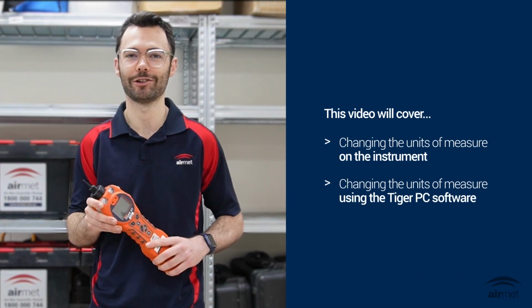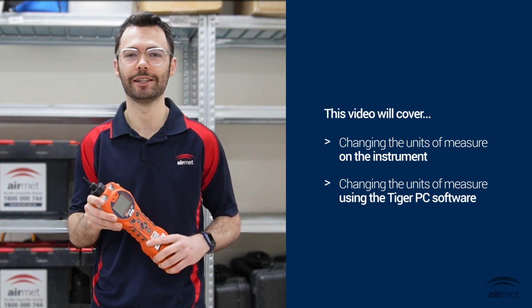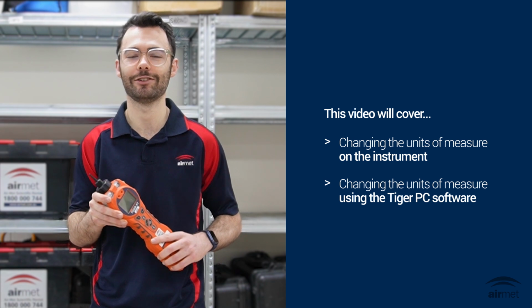The Tiger XT can display readings in a variety of units of measure, including ppm, parts per million, ppb, parts per billion, or milligrams per cubic meter. The default unit of measure is ppm. You may, however, need to change the units of measure depending on your application.